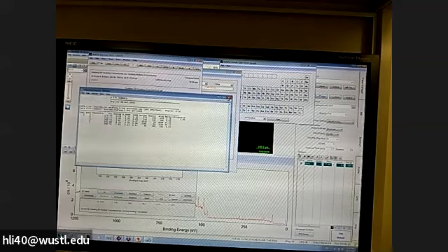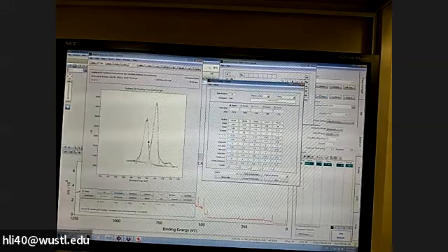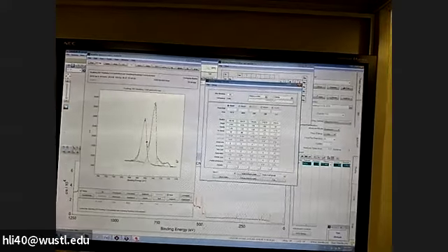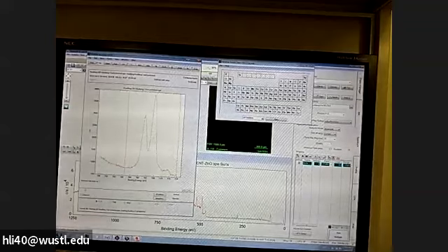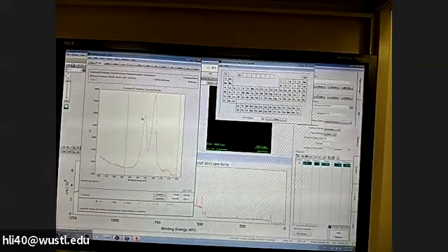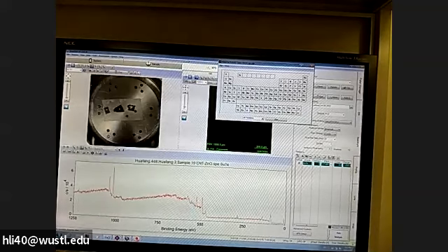So what we save here is your spectrum, your baseline, your different fitting curves there. Sometimes it's useful, and after it's finished, you just click Exit. So you come back. So I did a quick introduction of how we use the software.